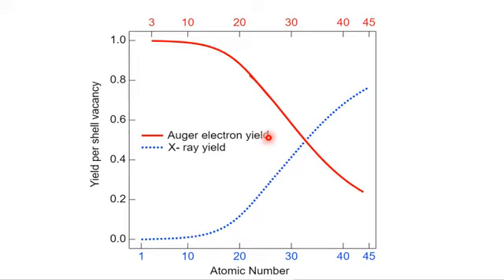So when the energetic electron beam falls on the inner core shell, the core K electron will be ejected and an electron from the L shell will jump into the core K shell. Due to the transition from the L to the K shell, characteristic X-rays are emitted.